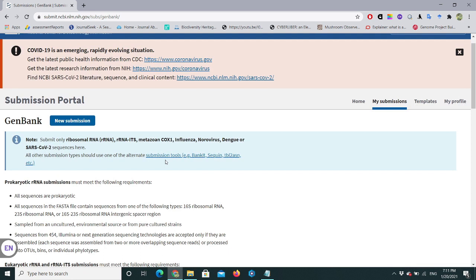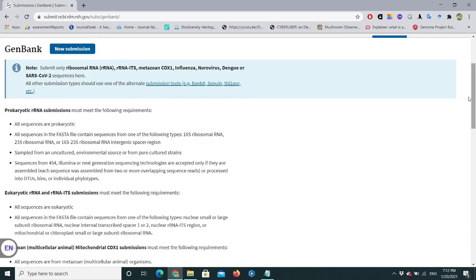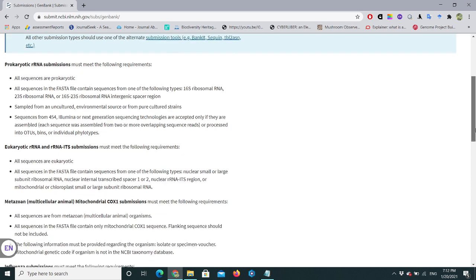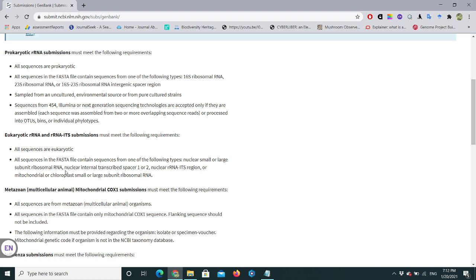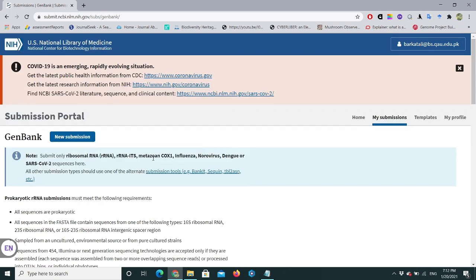Here you can see the submission portal with different options for different organisms and sequences: prokaryotic rRNA submission, eukaryotic rRNA submission. All my sequences belong to fungi, which are eukaryotes, so I'll select eukaryotic rRNA ITS submission. We already have the FASTA files prepared, so let's click on New Submission.